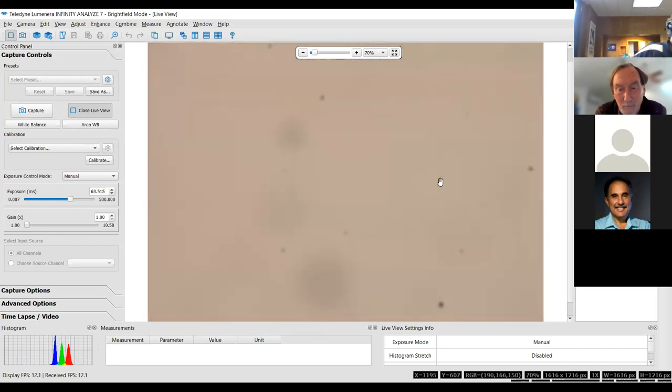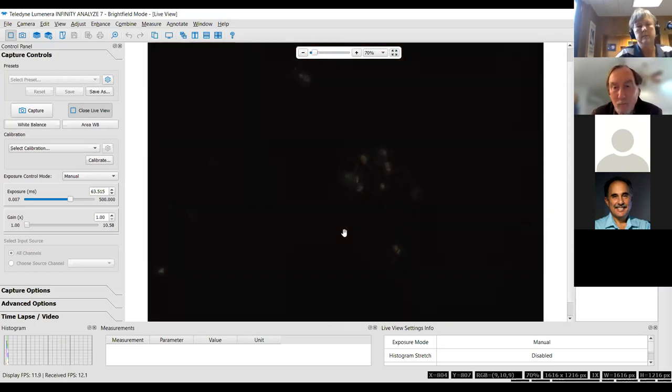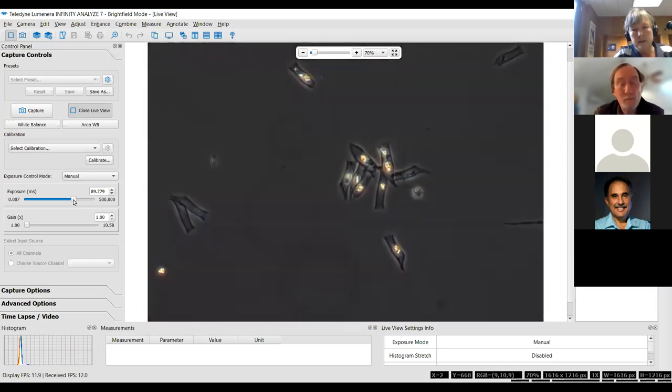And then let's look at some of the chrysophytes. Let's start with the ones that are the most recognizable. And now we're getting to ones that don't have a lot of stuff to them. So pretty much you're going to want to be on phase. And you can see that each of these cells, depending on the status of the population, you'll either have a lot of coloniality or they'll be mostly single cells. And this one is mostly single cells.